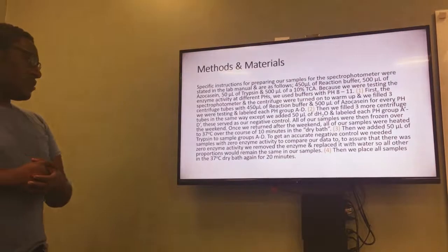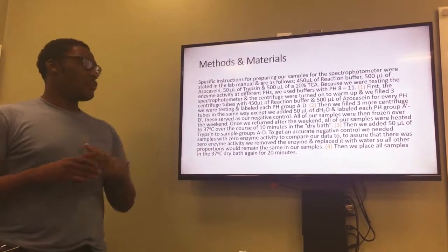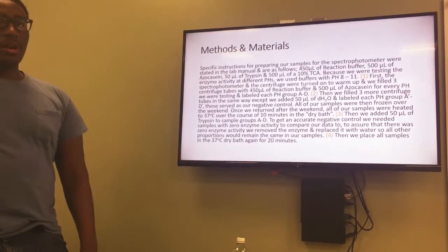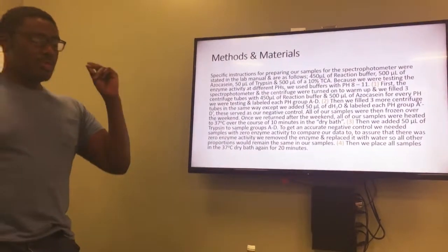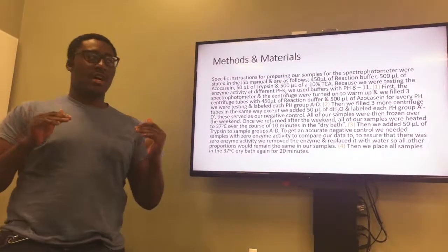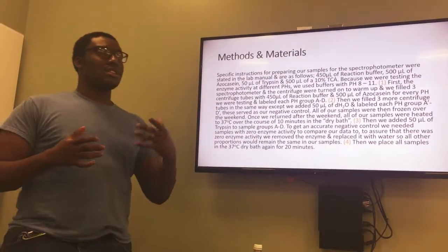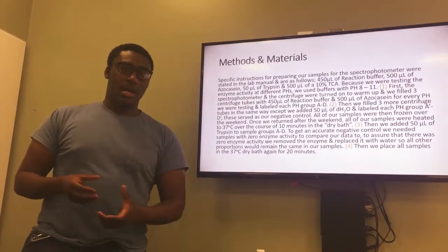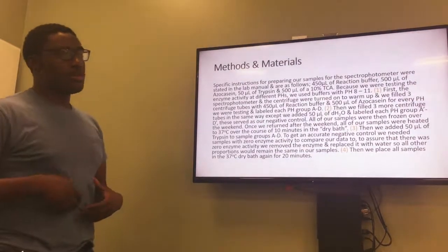Then we placed all the samples in the 37 degree dry bath again for 20 minutes. The reason why we kept this condition is because we wanted to make sure that both samples are in the same situation, but one had enzyme and one didn't. And the condition is supposed to match the pancreas of a human being.